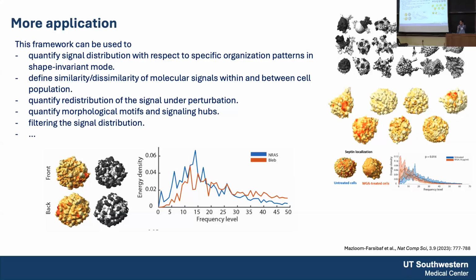Actually, one of our former postdocs, who is a professor in Minnesota, Megan, did this package. She developed a package to detect the morphological motifs, the blebs versus the filopodia versus the lamellipodia. And we also have an ongoing project with Felix in our lab, who developed a pipeline that can capture these protrusions and classify them. Yes, we've talked to Megan about applying that to some of our data, so that's great.